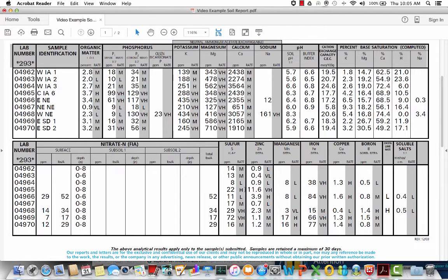So if values like that come back that don't make sense, what you may want to do is go back out there and pull another sample. You probably got into an area with some very high values. That can also happen with banded fertilizer. If you're doing strip till or maybe some type of a starter fertilizer, a 2x2 with fairly high rates, you can come back with some very high values if you get one of those cores coming out of that fertilizer band. And those values are not appropriate for making a fertilizer recommendation if they don't make sense. So it probably would be best if you went out and pulled that sample a second time.